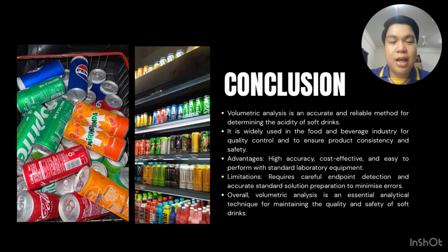However, the method also has some limitations, such as requiring careful endpoint detection and accurate preparation of standard solutions to minimize error. Overall, volumetric analysis remains an important analytical technique for maintaining the quality and safety of soft drinks.